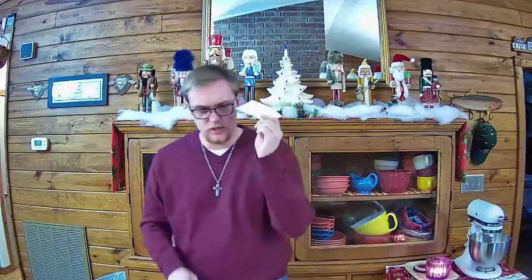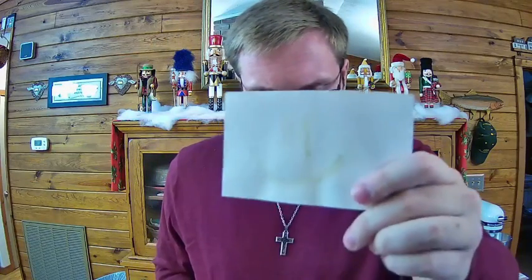Here's a third one. So I'm going to go a little above and beyond here. There was a change in color that we observed. It went from clear to sort of like a coffee stain kind of color, a little bit yellowish, brownish. So I'd say coffee stain would be a pretty good color for that.